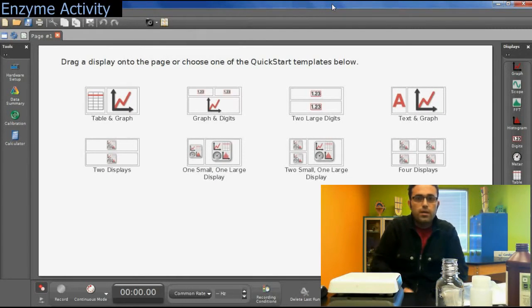Hello guys, in this video I'm going to talk to you about the enzyme lab that we're going to do on Thursday. You're going to use oxygen sensors to measure the enzyme activity. The enzyme is derived from yeast. Yeast cells are used as the catalyst source.